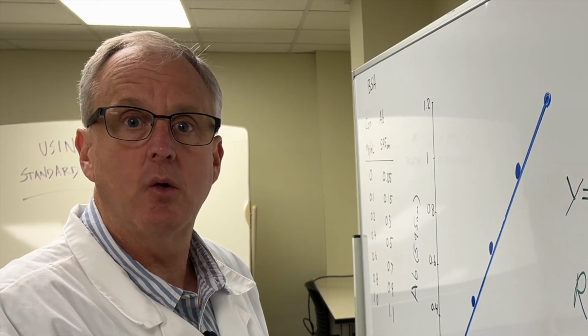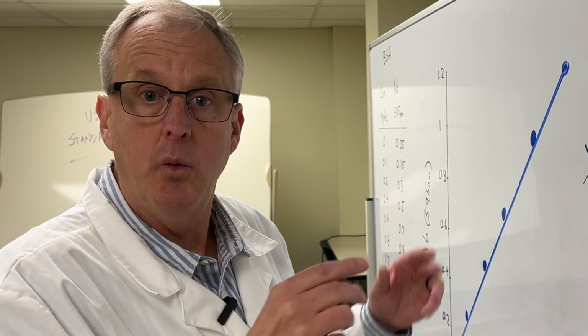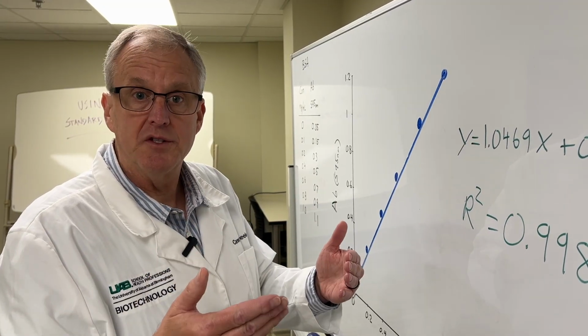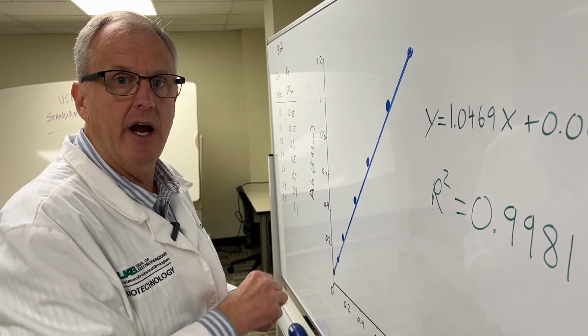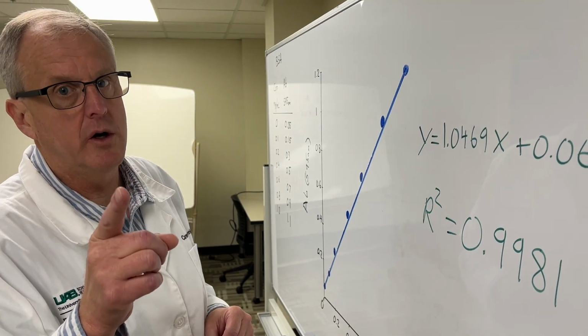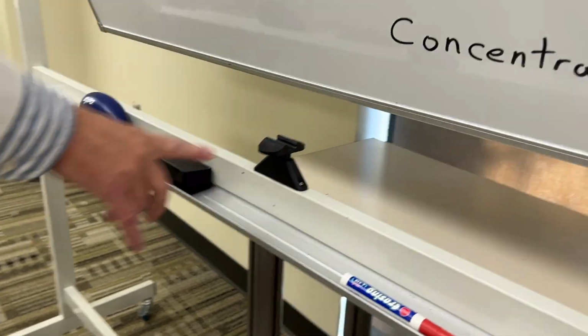How are we going to use this line equation? Forgot to tell you. You also need to take a sample. We have 2 samples that we've done right here, and we have to get the absorption of our samples. Now, we're going to match that absorption up with this line, using that line equation to determine our concentrations. You're going to say, how? Good question again. You guys are full of good questions today. Let's flip our board.